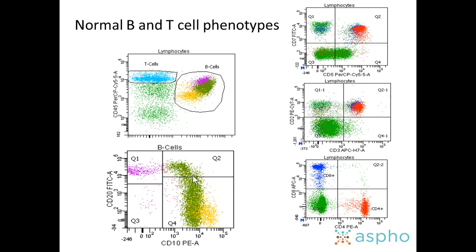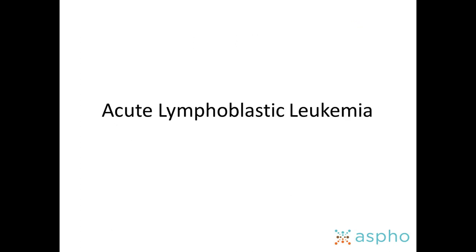They gain CD20 and they lose CD10, such that you have the mature surface immunoglobulin positive cells here. If you can fix this hematogone plot of B cell maturation in your mind, B cell leukemia usually deviates, often being a population that's brighter for CD10 than the normal hematogones. Something similar is true for CD3, CD4, and CD8 in the T cell lineages.